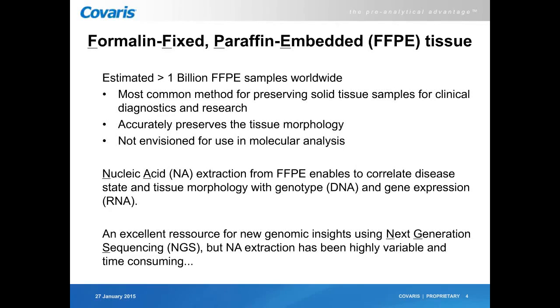So what are FFPE samples? FFPE stands for Formalin-Fixed Paraffin-Embedded. It is estimated that there are more than 1 billion FFPE samples worldwide. And actually, it is the most common method for preserving solid tissue samples for clinical diagnostic and research. So it preserves the tissue morphology, but it has not been designed for use in molecular analysis.